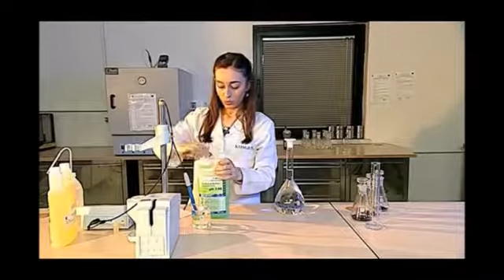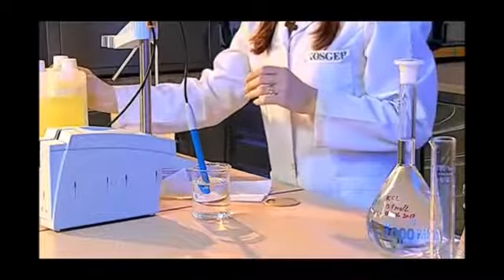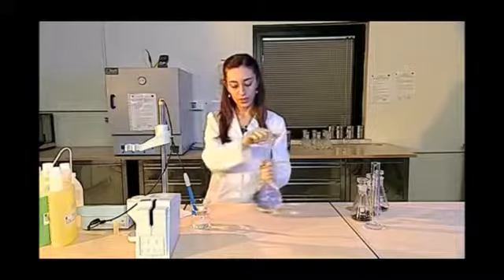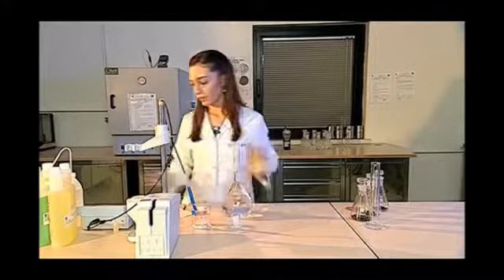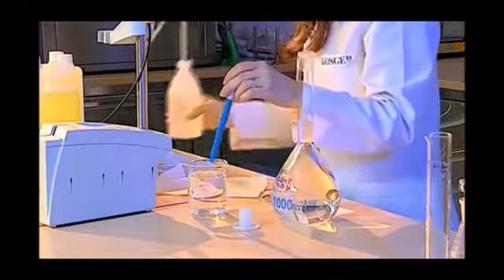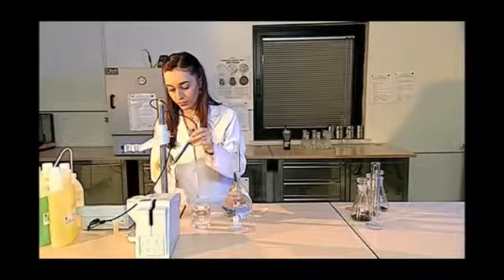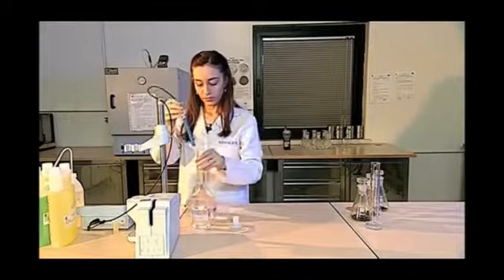When the test is not in progress, that is, when the pH meter is off, the electrode tip of the pH meter is kept in the potassium chloride solution. Now I measure the pH of the solution. Again, I wash and dry the electrode with pure water and immediately dip it into the solution.